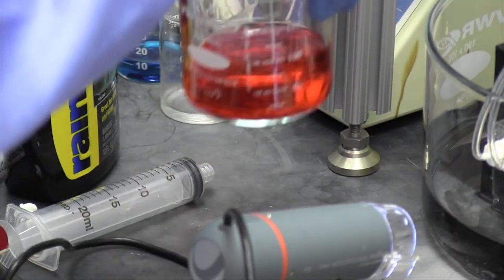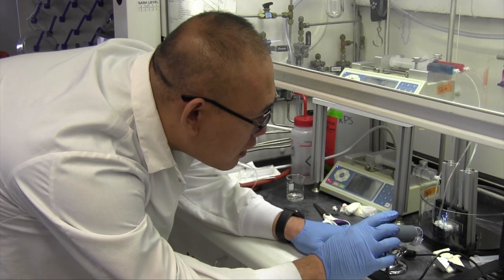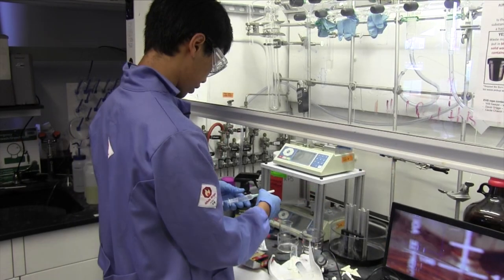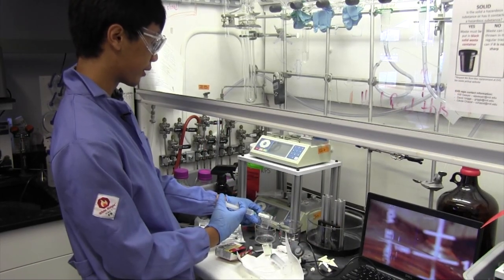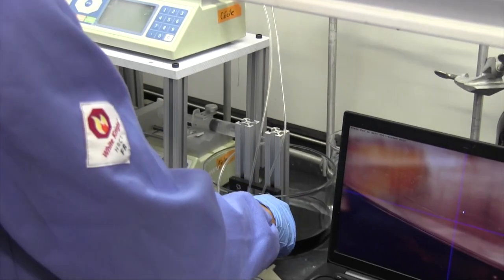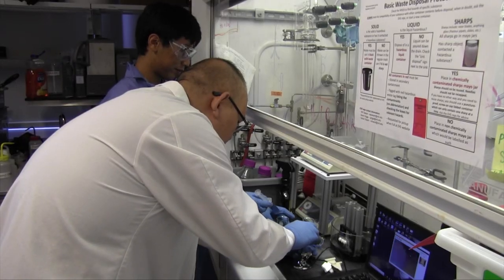Okay. In addition to 3D printing, I'm learning a lot about polymer chemistry and some topics I've learned about in school but never really had a chance to explore in person. Now what I'm doing is blowing this solution, it's just Rain-X, something you buy at the store, to make it a little bit more hydrophobic so we can get a better flow profile of our solutions through the channel when we're actually making the polymer.